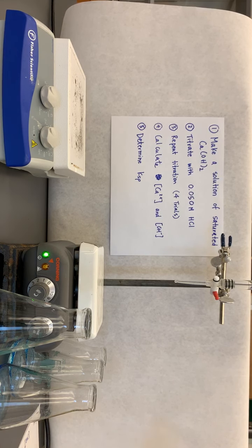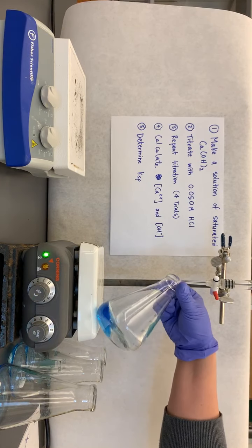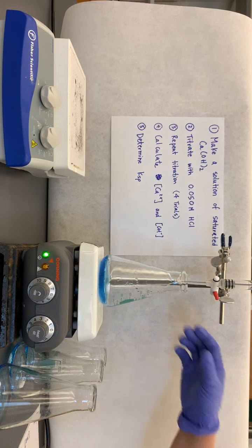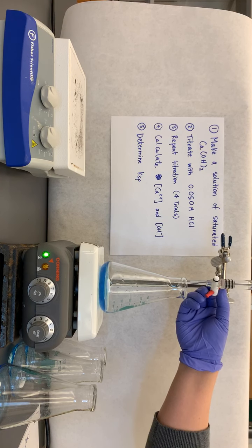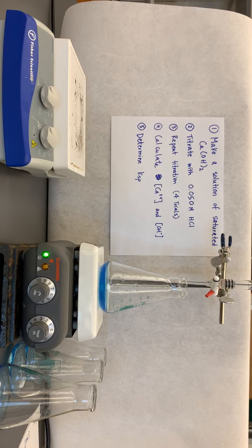Okay, so now what I'm going to do is I'm going to go ahead and start titrating. Okay, and in the burette I have HCl. Okay, and I've got my stir bar stirring. Okay, and I'm just going to go ahead and slowly add my HCl. And I'm looking for a change in color. Okay, and the change in color should go from blue to yellow. It's like a yellowish greenish color.